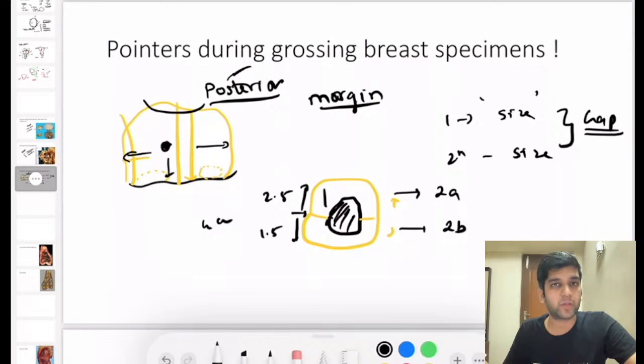So it should be confirmed on a microscopy, though gross is the way we go forward usually, but microscopy is required, because the TNM staging alters the treatment radically. So at least for breast, please do that. It's the ideal way to do for every cancer.